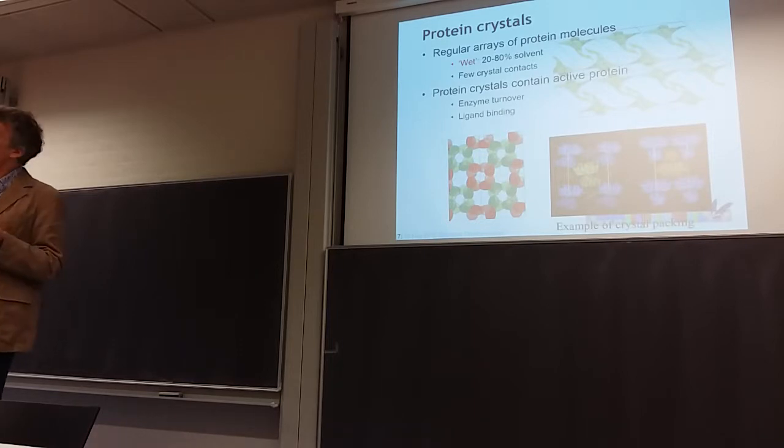That's very nice, because that also tells us that the crystal is at least close to the native state, close enough that it's still functional. Right? Because one of the worries that you should have when you stick your protein in a crystal is that it's different from the environment in the cell, and the protein might respond to that by changing its shape. It usually does, right? But it's not always that bad. That's the take-home message.